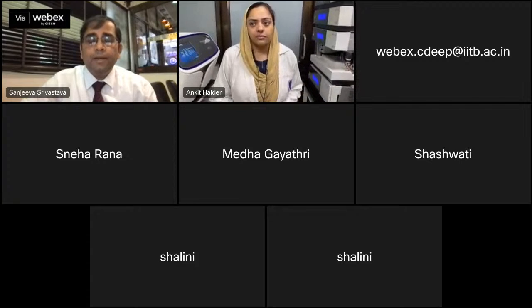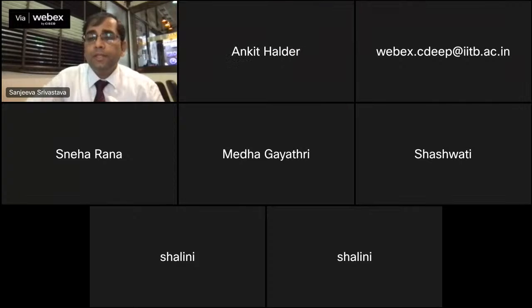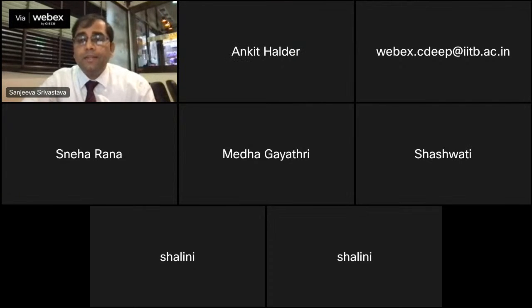All right, thank you, Meher. And again, the same instrument, but since we are using the high flow rate here, you can do these kind of tests in a very short time.